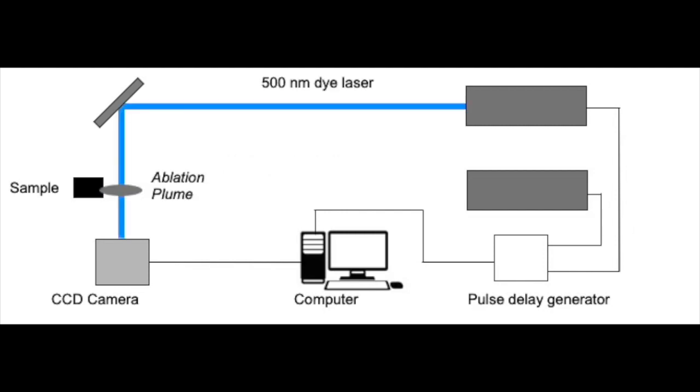Immediately after that first pulse, we shine a second laser pulse at the spot where the first laser pulse hit. The explosion from the tattooing creates a shadow that we can see with a very fast camera. Here, you can see the sample before being zapped by the laser, and then 124 nanoseconds after the laser pulse, showing an explosion of the tattooing and the formation of a shockwave. From that, we can figure out how hot and how much pressure the laser creates when it hits the tattoo.